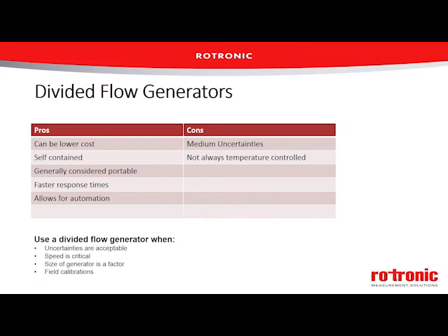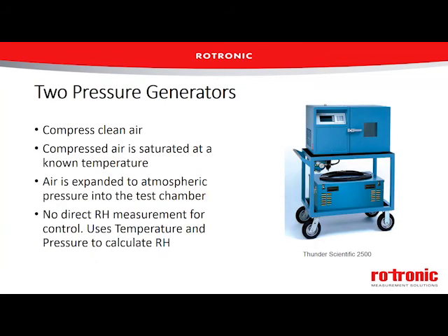So these generators, they're getting quite common, especially for field calibration type applications, but they're also used in a number of laboratories as well. If speed is the critical factor, this is probably the technology to use. And if you're looking for a smaller device, these are probably the smallest active generators out there.